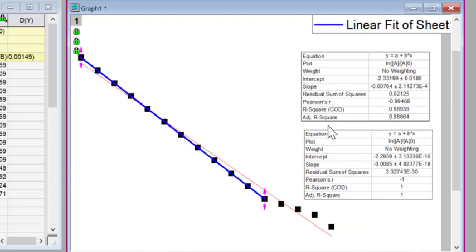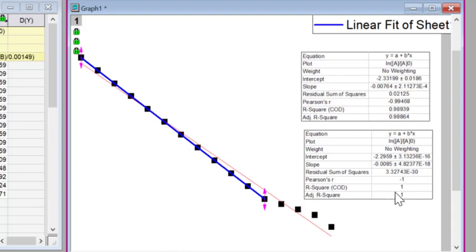And if we compare, for example, the R-squared value with all of the data with the R-squared value of our selected data, we can say that's better. So that's a good argument, perhaps, for saying we should just take the selected data.